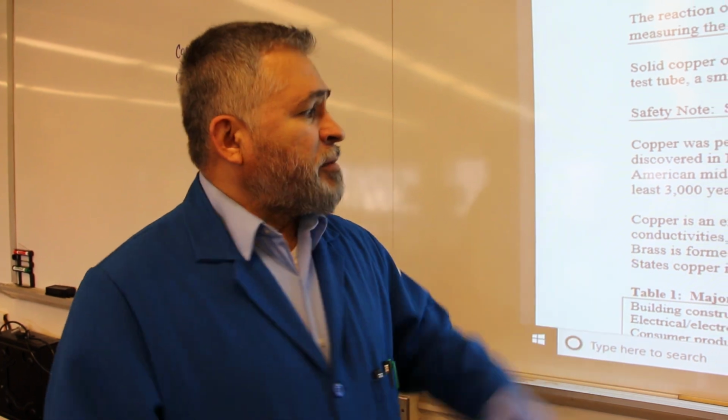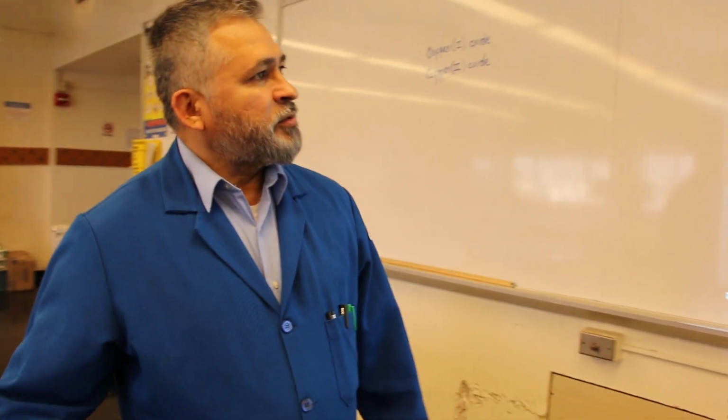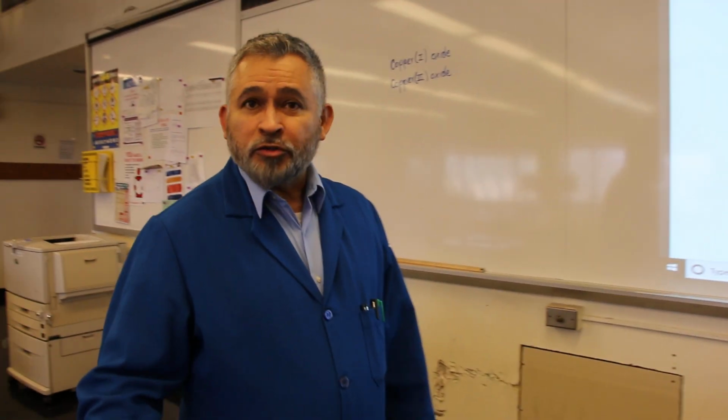All right, so let me show you what we have here step by step on your handout. Again, I would recommend having this ready. You can pause the video, get this document in front of you, and then follow step by step what we are doing here.